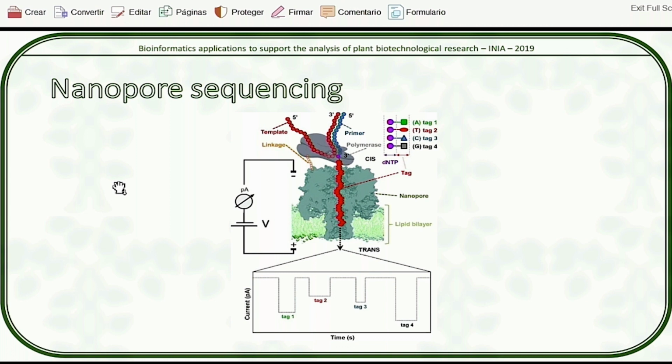To be honest, I've never made a library for this, I've never actually gone to the lab and done it. But there are bioinformatics approaches to tackle contamination if you have some. Sometimes you do. There are many ways to see that, and then you can claim, hey, because you usually send it away for sequencing, I sent you monkey DNA, and I'm getting octopus. Why? If you have a good sequencing provider, they would check that your DNA is of high quality before sending you the results. But you still do the sanity check anyway. I always double check it.